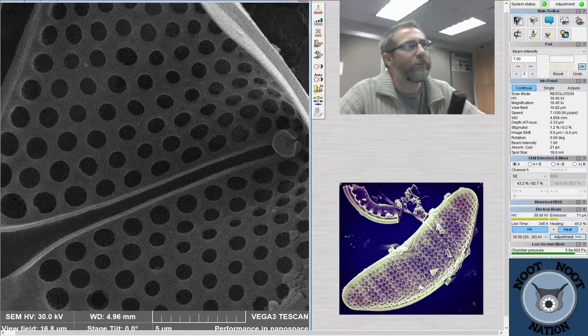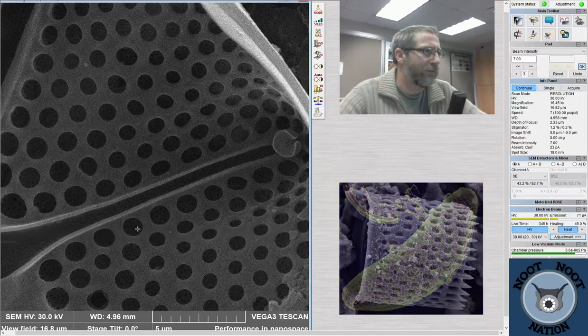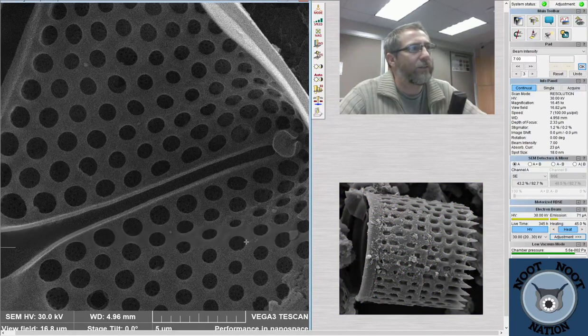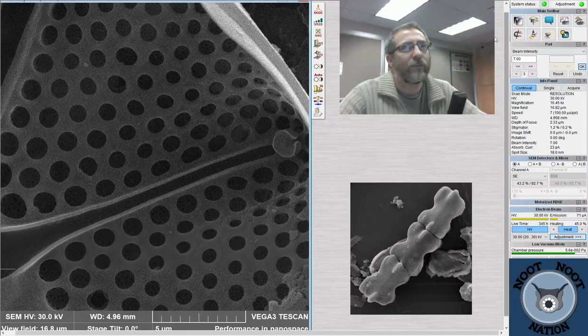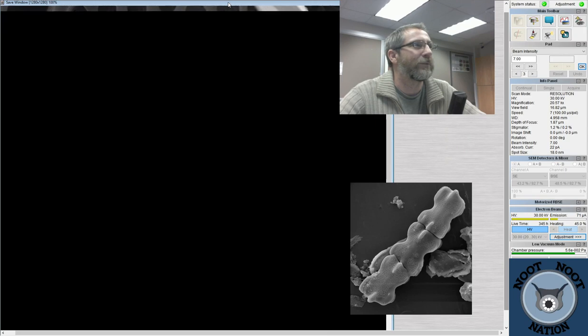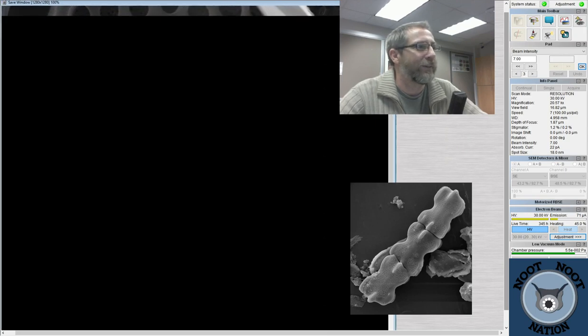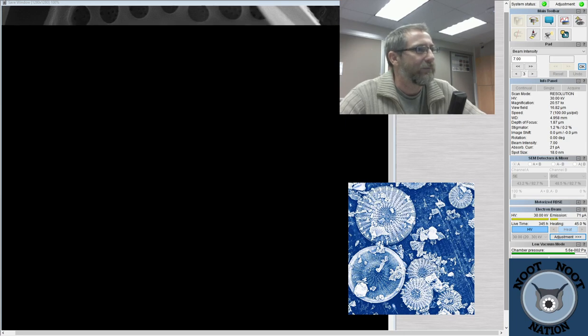And if we had something that was really small and we wanted to try to get an even better view of it, I could always lower the beam intensity and slow down the beam a little bit to try to get a good image of it. But since we're just kind of playing around today and I'm just showing you some cool diatoms that we found in San Francisco Bay, I don't want to spend 10 minutes collecting images. So, okay, moving down through the material.